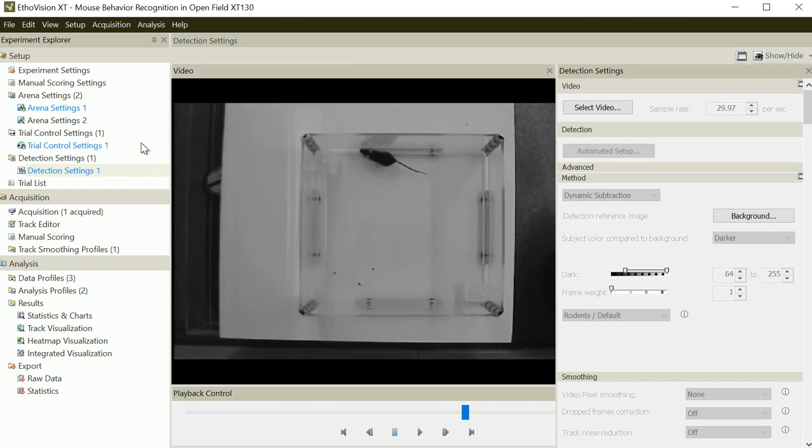If you have a light, for example, somewhere around here, you should not light into the inside of the arena directly, but you should point the light to the ceiling. The light will go up to the ceiling, and the entire ceiling will softly reflect the light, and then will light up your arena indirectly, very softly and gently. And this is one idea.